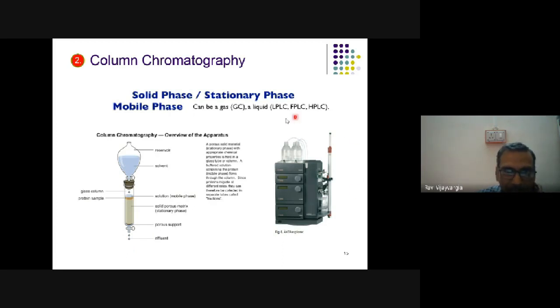While the same thing can be done by machine also, the ease of using it is that it is completely programmable. You can use computer software. You can program the flow rate. You can program the sample volume, and all those things can be programmed. So these are the buffer containers. This is the column in which the sample is.